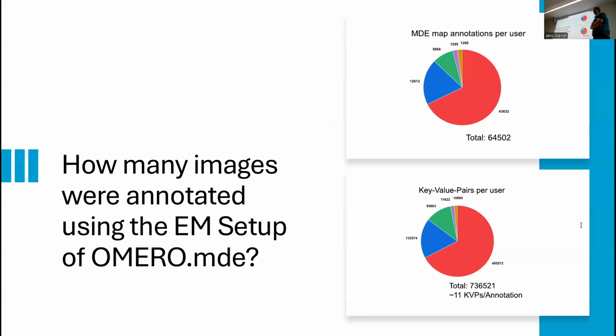So what we are going to try now for light microscopy is to switch from user-driven import via the importer to in-place import, and it will only import with a minimum of metadata provided. And then we also want to restrict other ways to shuffle the data away.